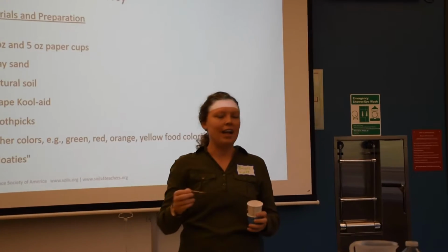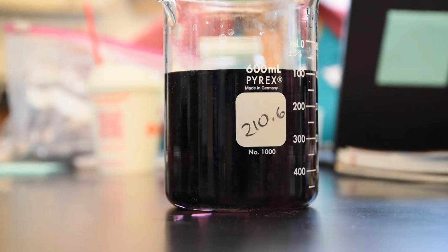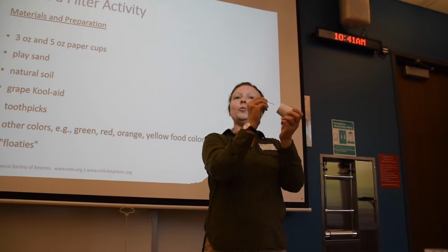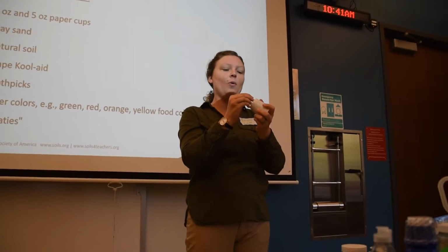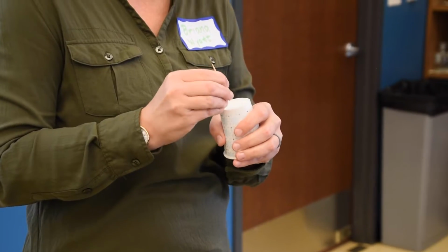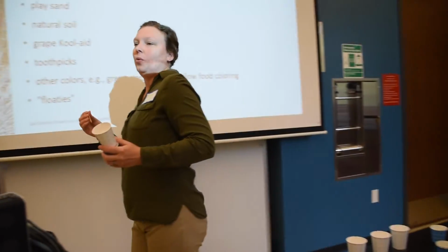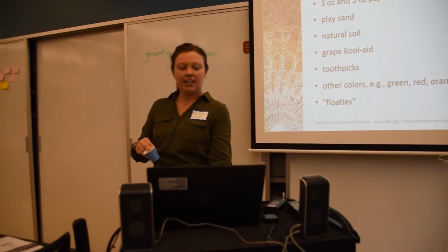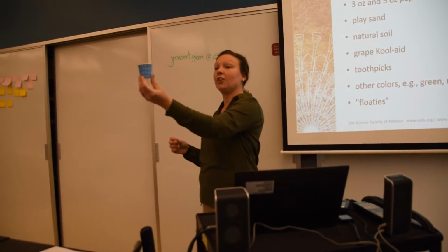So you should all have all of these materials in your buckets. The large cups, poke holes in the bottom so that water can go through, as many as you feel. So once you have poked the holes, take your smaller cup for each pair.